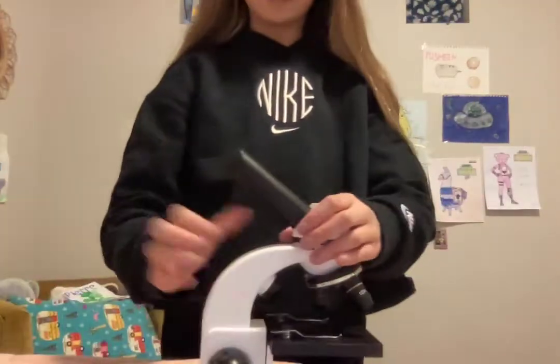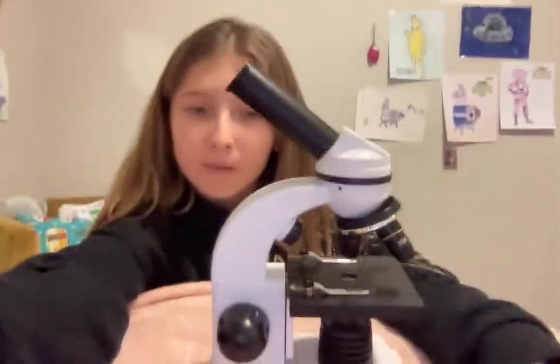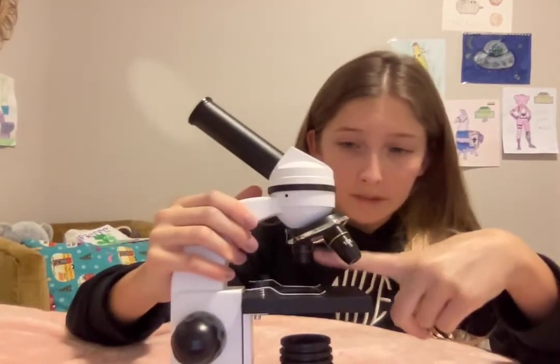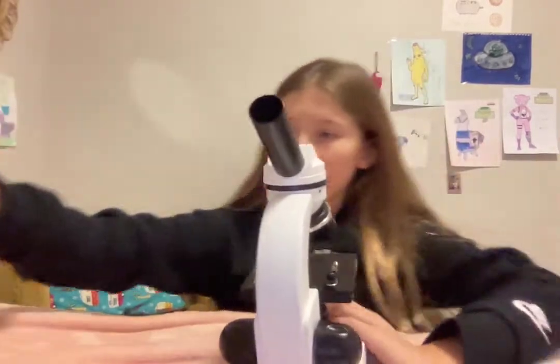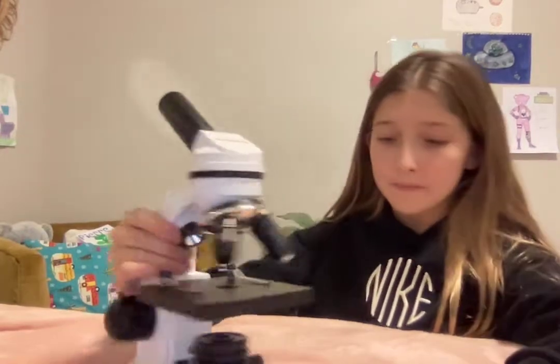So let's get into the video — how to work this. This part is all made out of metal right here, and this is like strong plastic. To get it ready, I recommend starting on the four times magnification. It usually comes with a lid, so you take that out. Make sure not to lose that unless you just want to keep it.